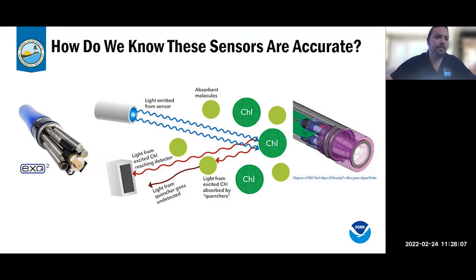So here's a figure that diagrams how the sensor is emitting a specific wavelength of light targeted toward our pigment of interest, which is chlorophyll A. And so this chlorophyll pigment gets excited by this blue light and fluoresces red light to dissipate some of this photic energy, which Gabby mentioned in a previous presentation. And so this fluorescent red light is therefore detected by the sensor and then quantified to give us an output.